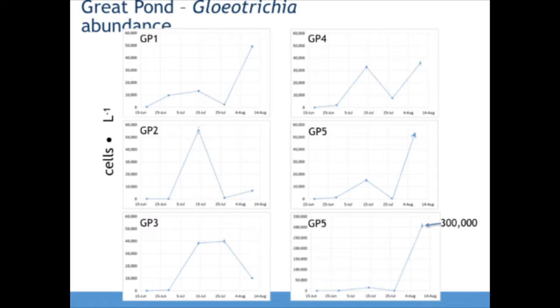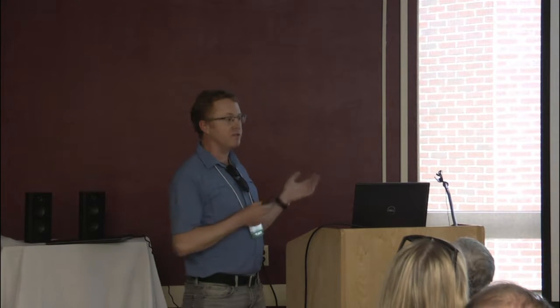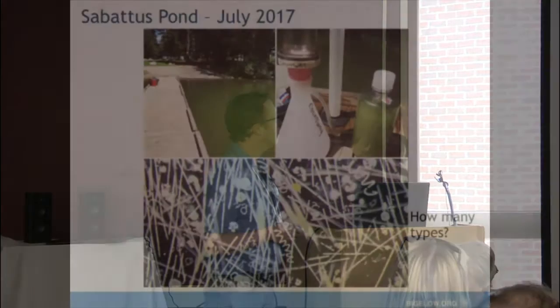And we did this for, again, 5 different sites in each of the lakes. We detected some very high copy number concentrations. Other times of the year, or the summer, it just wasn't there at all. This is the same type of analysis for Long Pond. So again, it's a rapid technique. Once we got the method worked out, we ran all of these samples in one afternoon. So it's not like sitting there under the microscope and counting for days and eyesight going blurry.